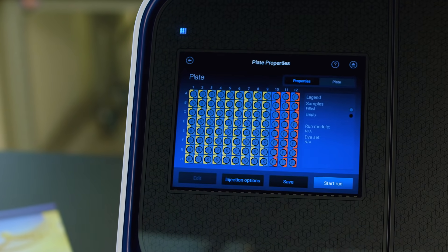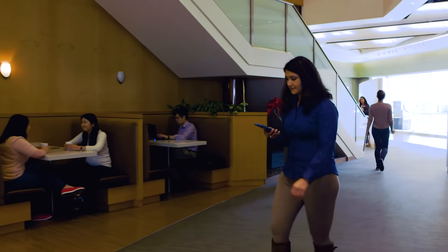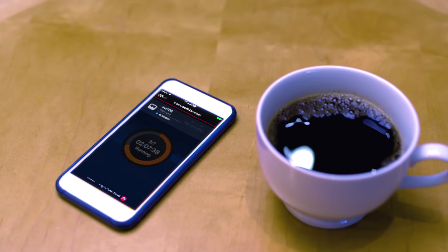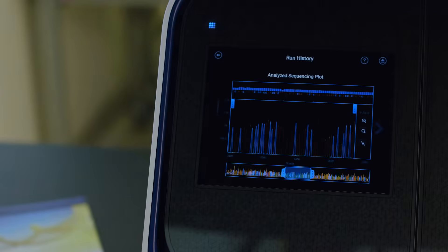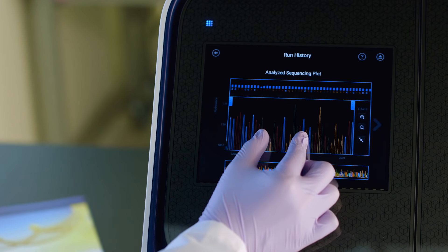Let's run. Check your run while you get started on another experiment or take a break. Stay on top of your instrument's availability, monitor progress of a run, and view Sanger sequencing or fragment analysis data in real time.